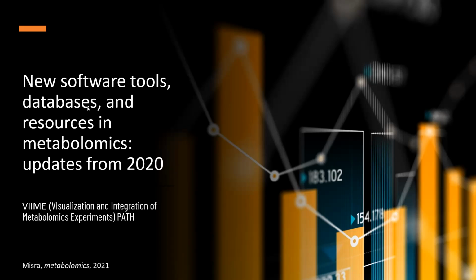Obviously they have to die to have collected the tissue, but these are serious cases of infection in the brain. And in the past, we've never actually been able to analyze these FFPE tissue samples. So she is developing a protocol to do both metabolomics and proteomics on the same sample. And we look forward to seeing those results coming from her in the near future.